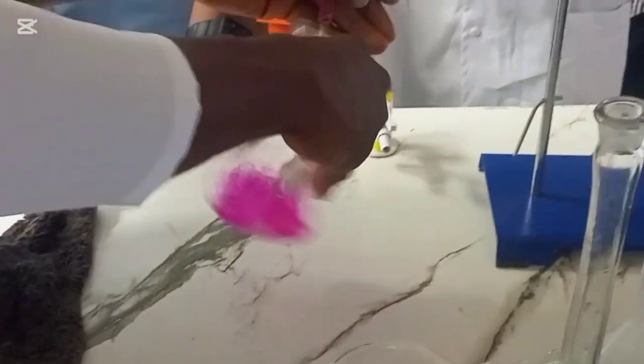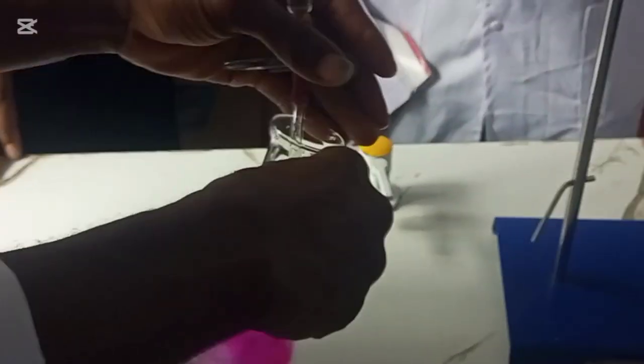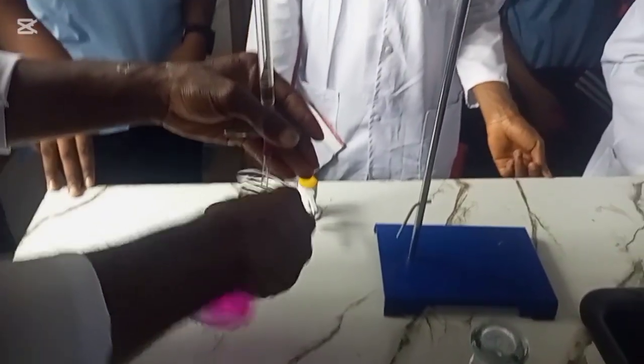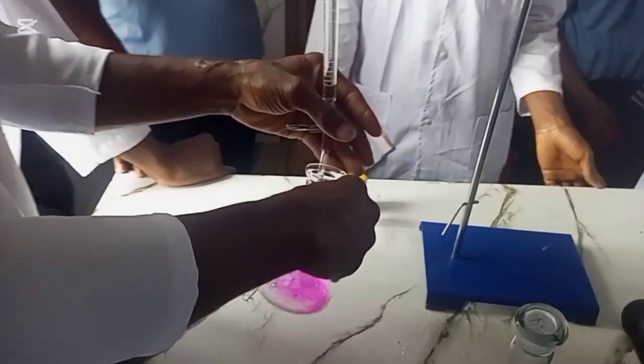You have to be very careful because you don't know when the color will change. The essence of rocking it is so that any drop that goes into the flask will go round about and not stay in one place.